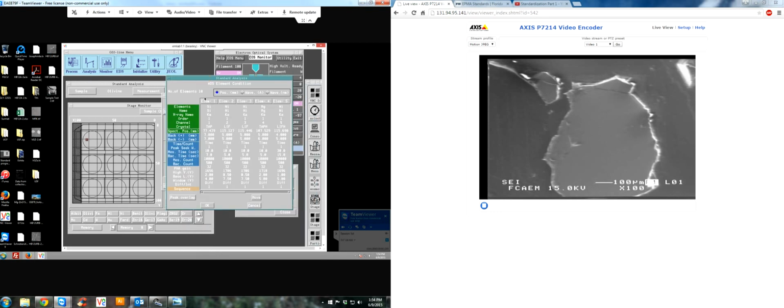All right, we'll pull this up. And this is where you also check for peak overlap. This information here, it's kind of like is the WDS element condition here. This is our calibration. We do this on our own, so you don't have to worry about that. The only thing you may have to worry about are the positions of where it starts measuring the principal peak of each element.